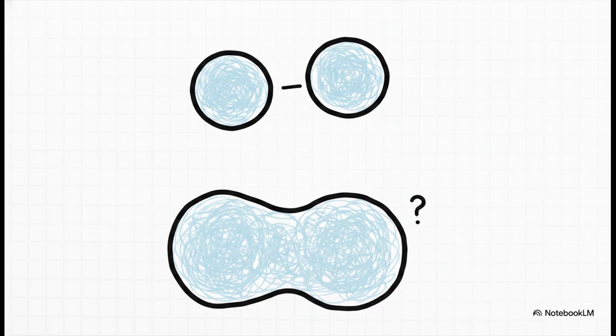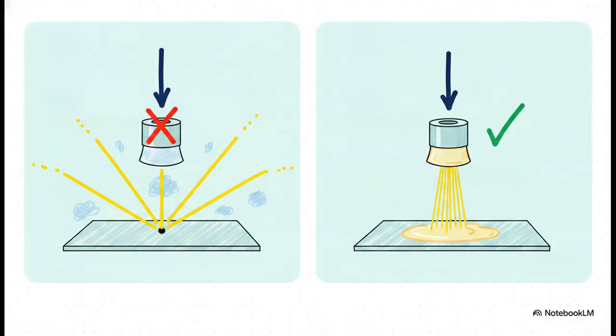Now, I want you to remember this absolutely crucial rule. Lower values for resolving power mean higher resolution. No, seriously, an RP of 160 nanometers means you can clearly distinguish two objects that are incredibly close together. If your RP was higher, let's say 300 nanometers, those same two objects would completely blur together into a single shape. So remember, lower RP, sharper image. But to get that crisp resolution at maximum optical power, we kind of have to bend the rules of physics. Glass and air have totally different refractive indices.